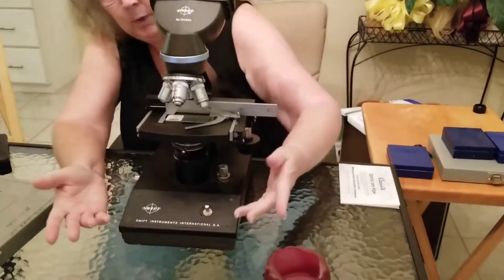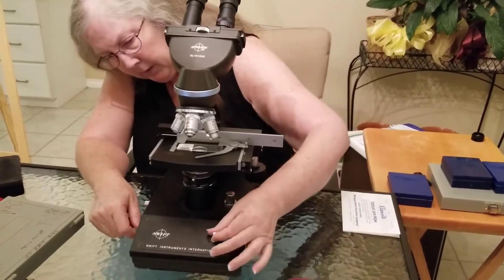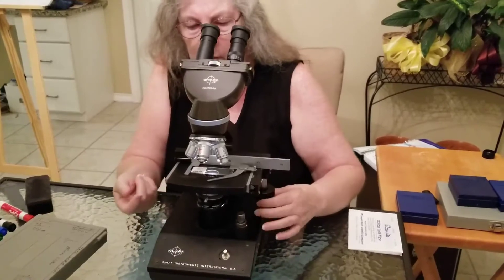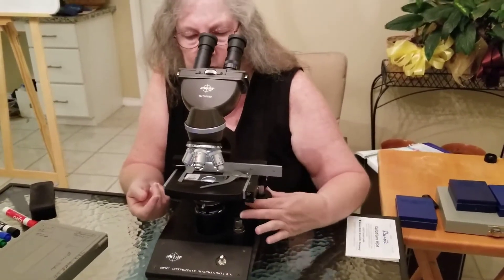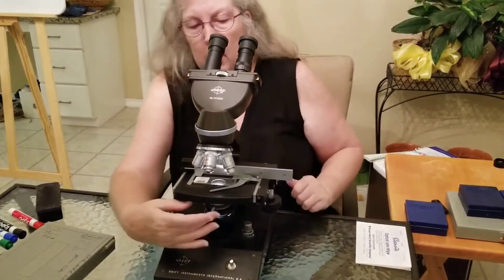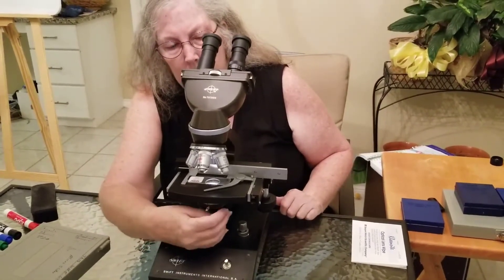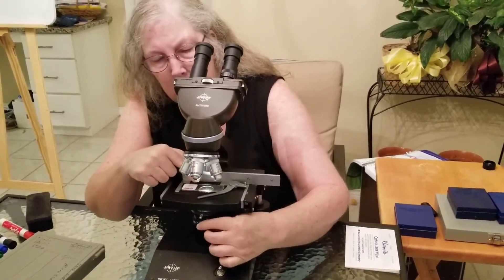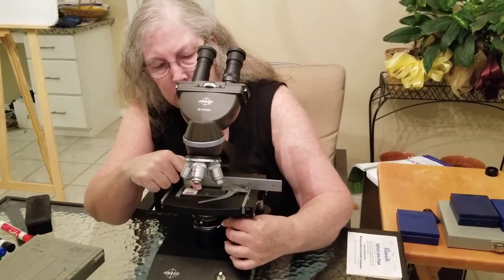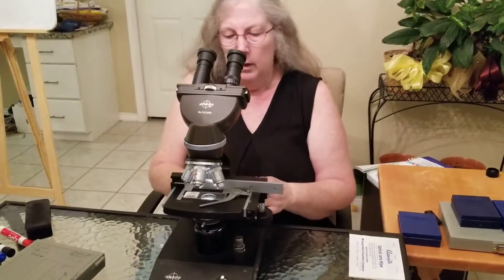Your light source is down here. Depending on the scope, the light switch may be on the front or on the back. The light is going to be shining up, and you can use these knobs to position your sample so the light is coming right up through it, centered over the light. Under here you also have your condenser, which is going to help focus the light up. There are some knobs here for the iris, which adjusts the amount of light — kind of like a shutter if you're into photography.